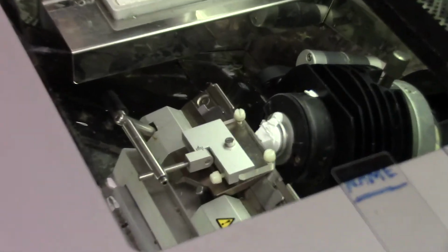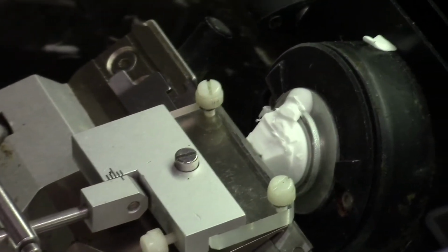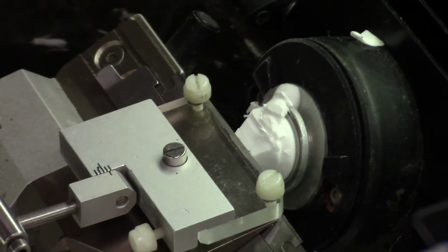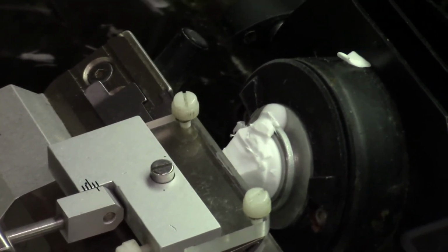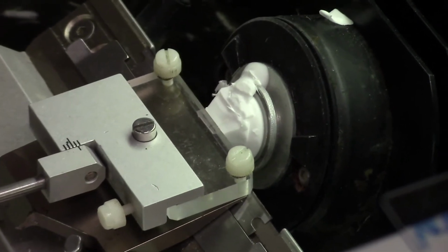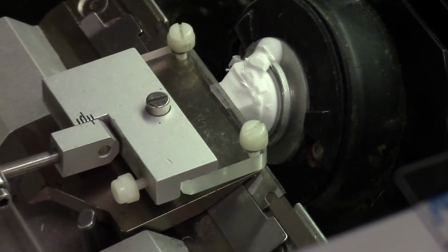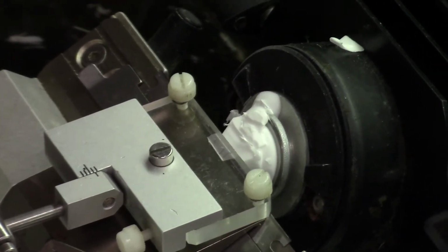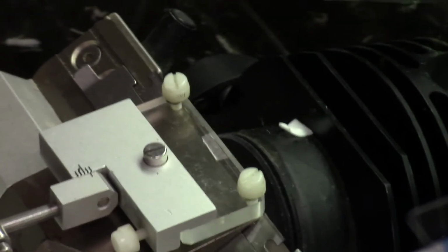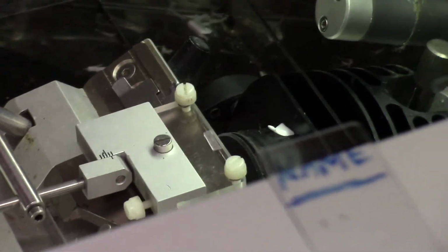Slow, slow, slow. As I do this more slowly, what will happen is the ice, as it gets cut, will curl and then relax. And then curl and then relax. So by going as slowly as I can stand to do, I can usually get a flatter tissue section.